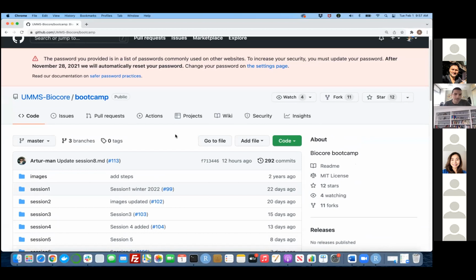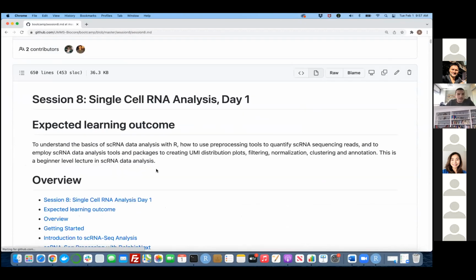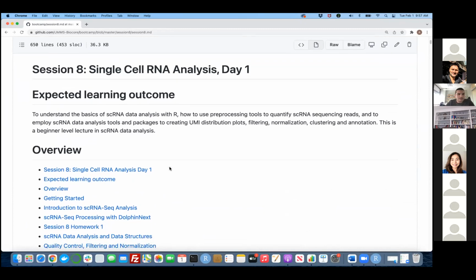We have to touch base with more machine learning algorithms, some more statistical methodology to actually explain why we are using single cell analysis the way we do. But this time we added a couple more exercises and hands-on practices for sequencing your own data with Cell Ranger and 10x genomics tools. So we're gonna just do all that.